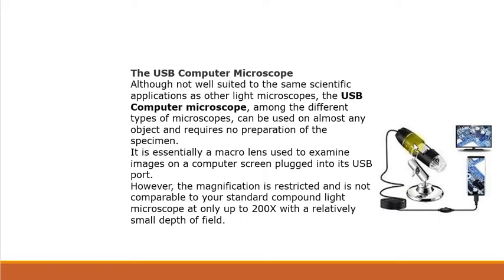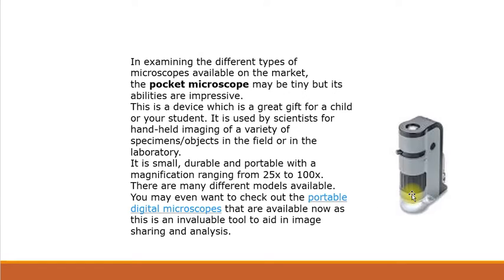It is essentially a macro lens used to examine images on a computer screen, plugged into its USB port. However, the magnification is restricted and is not comparable to your standard compound light microscope, at only up to 200, with a relatively small depth of field, but technically this is a more advanced microscope. Then another, this is a very portable and handy microscope. It is really very good to carry.